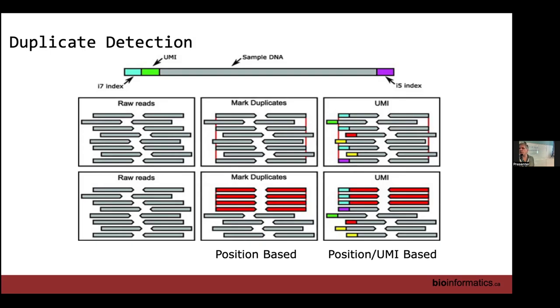So when you talk about a heterozygote, you're talking about base changes, differences between the reads, because really what we're looking for in duplication is that the reads we've generated are coming from a unique genome. So it's a different issue than talking about the variation that we're actually seeing.